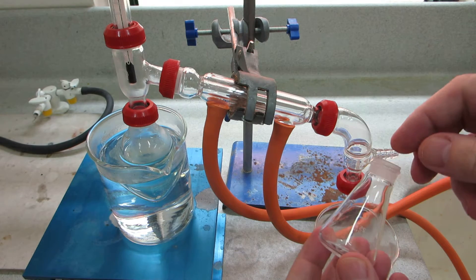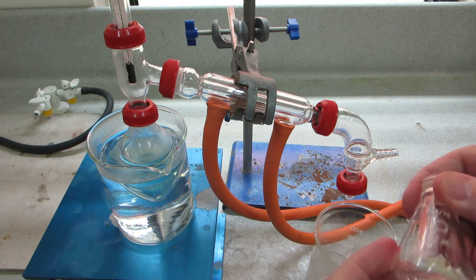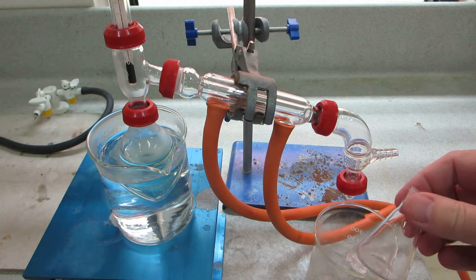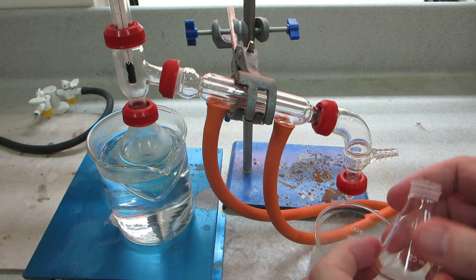We're going to collect any product that's produced in this conical flask here. And that's going to be surrounded by ice. We're expecting to get ethanal, which has a very low boiling point, around 20 degrees centigrade.